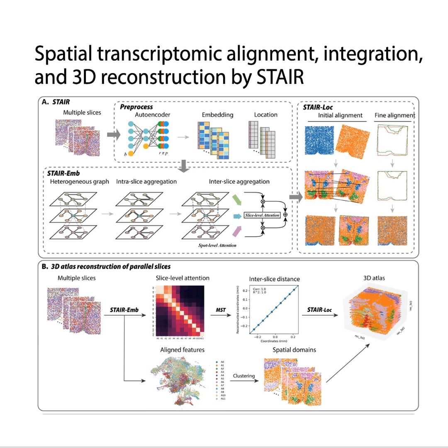That is just, it's ingenious. Using the internal molecular relationships to create external spatial coordinates. How did they validate this actually works? They use a perfect test case. 12 MERFISH slices from the mouse hypothalamic preoptic area.